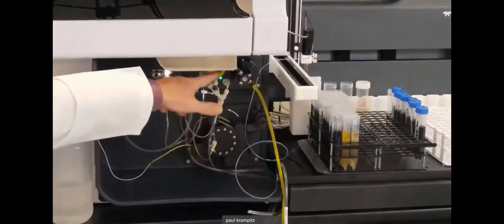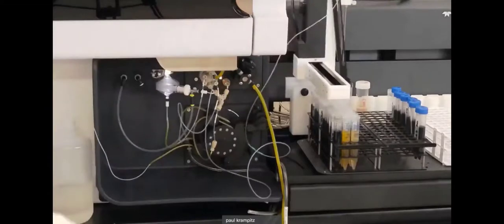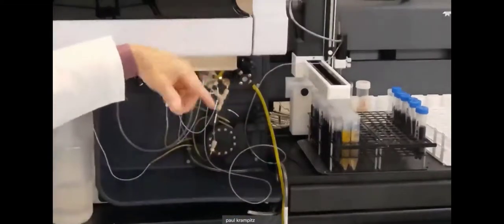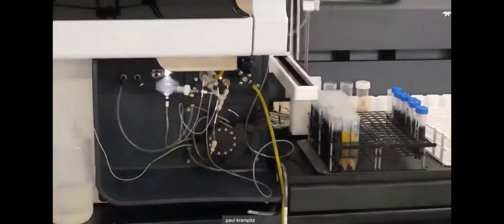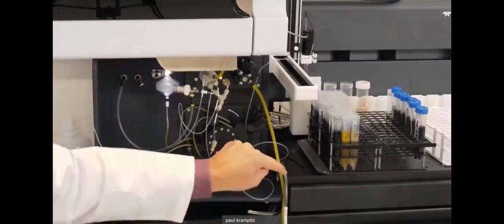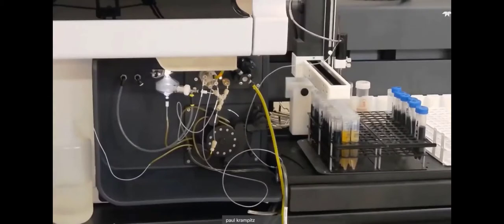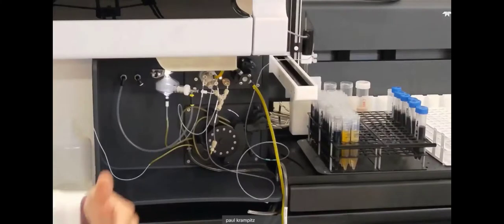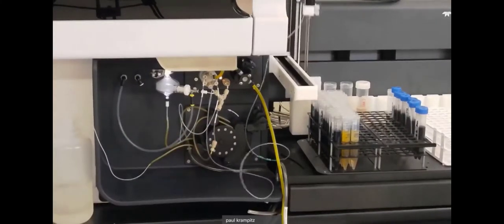And as you can see, this is draining the system out in the back of the autosampler. There's a rinse vessel and then a drain vessel down here. So the rinse is constantly refilling the rinse vessel in the back corner, right back there. And then the excess is being drained into an organic drain down on the bottom here that I'm not sure that you can see. It's right down here. But this is basically the setup for doing wear metals and oils, biodiesels, pretty much any organic application. But again, this specifically is extremely good for oils.